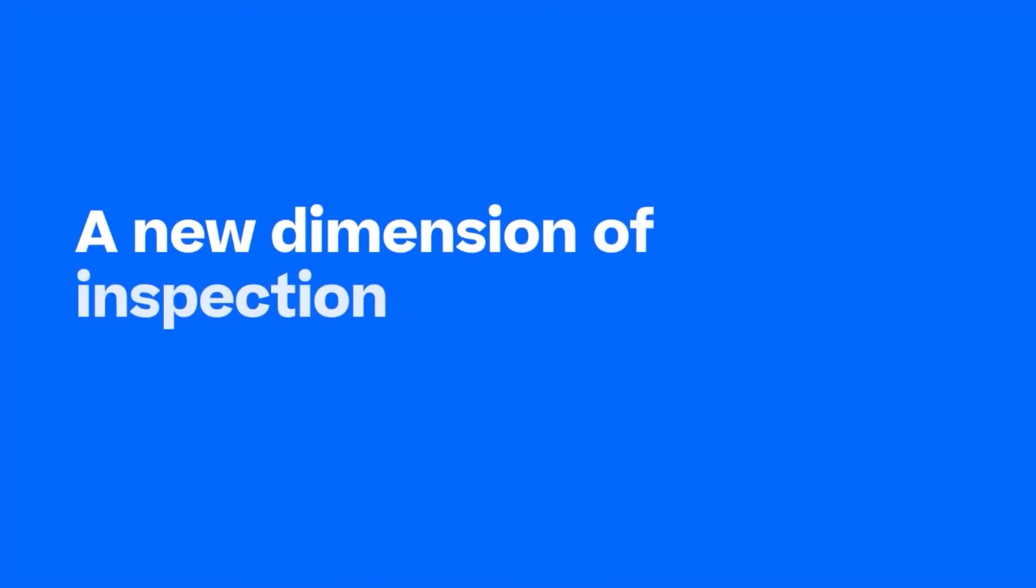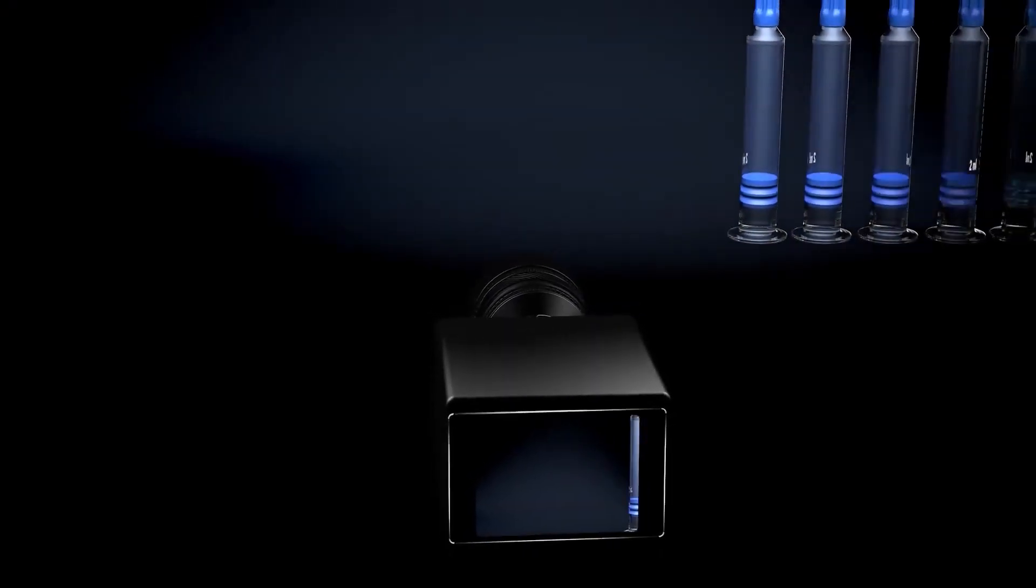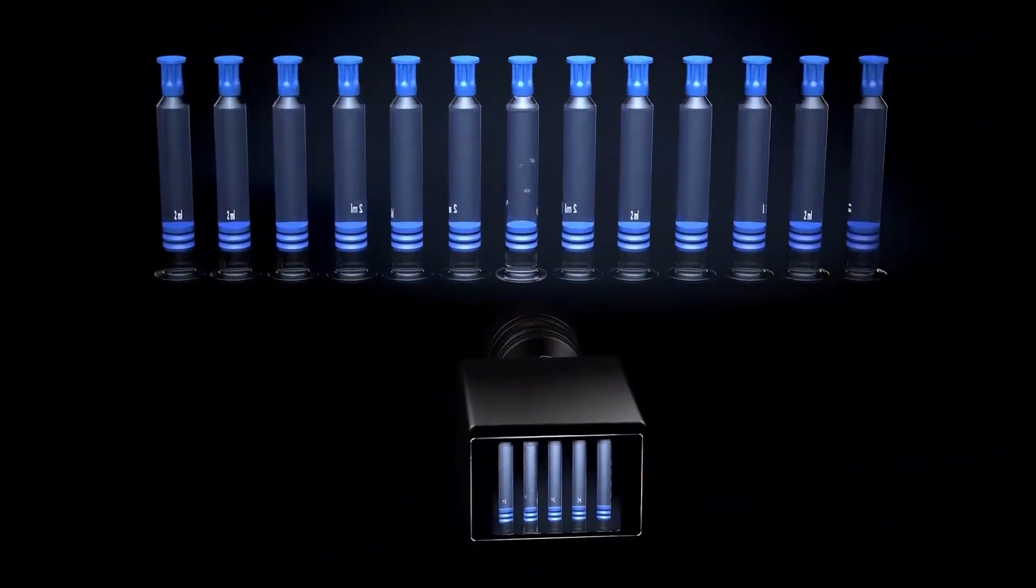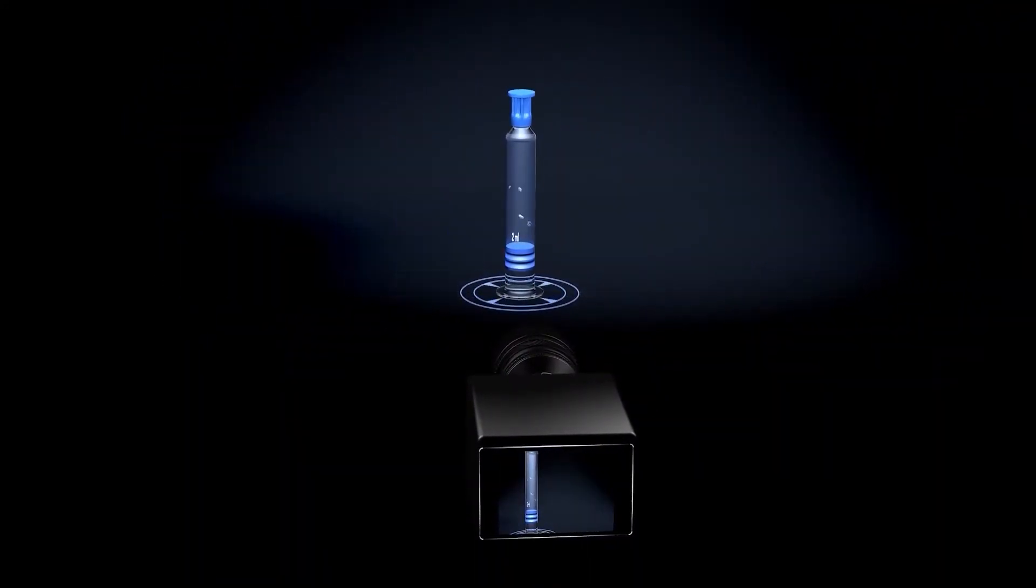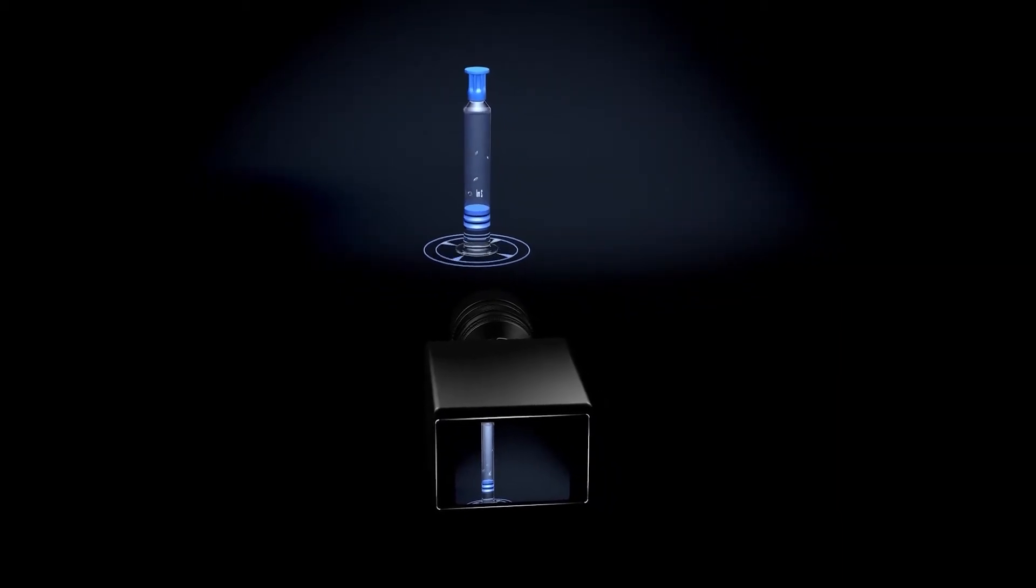Introducing a new dimension of inspection technology: 3D inspection of highly viscous products. This revolutionary 3D inspection by Seidenader Solutions enables the reliable detection of particles in highly viscous products such as hyaluronic acid.